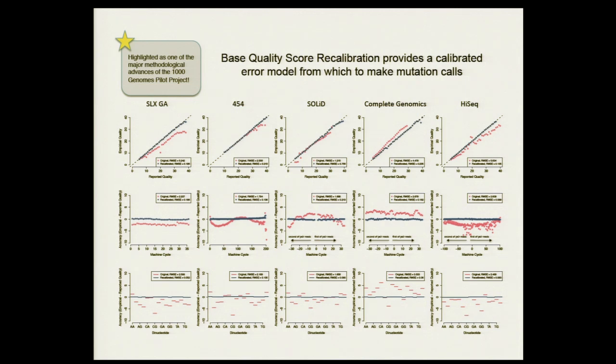It's going to show as mismatches, but actually was not a sequencing error. Yeah, I see what you're saying. So it's not a sequencing error. I don't think it's going to affect it. I'm just saying as a sake of curiosity. Okay. Yeah, I mean, it's interesting because everything here is very fuzzy, right?